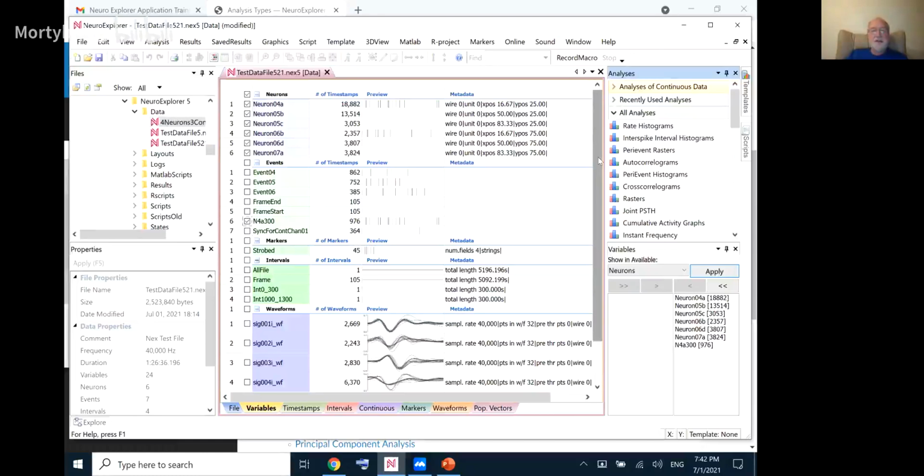Sorry, Alex, can I have a question here? You mean the scripts that you wrote and that customers can use, right? Yes. And can we also write the scripts by ourselves? Yes, of course. That's the idea. So I spent a lot of time integrating Python into NeuroExplorer. So scripting can be done in Python.